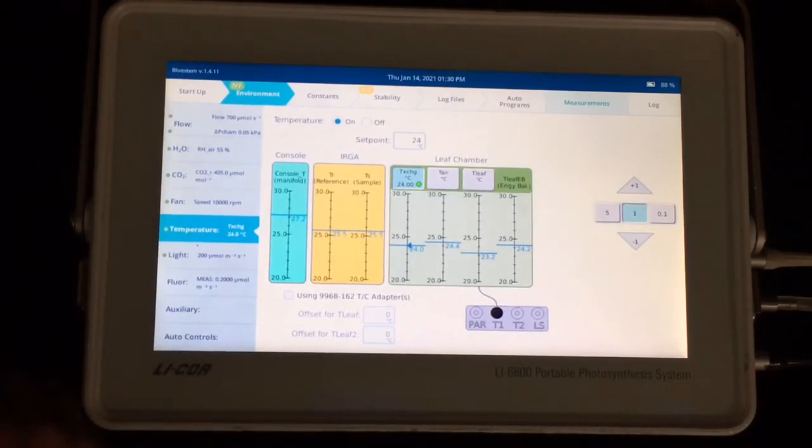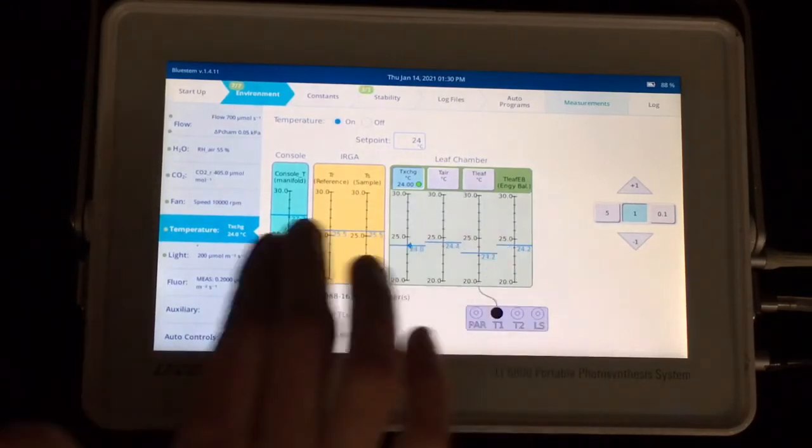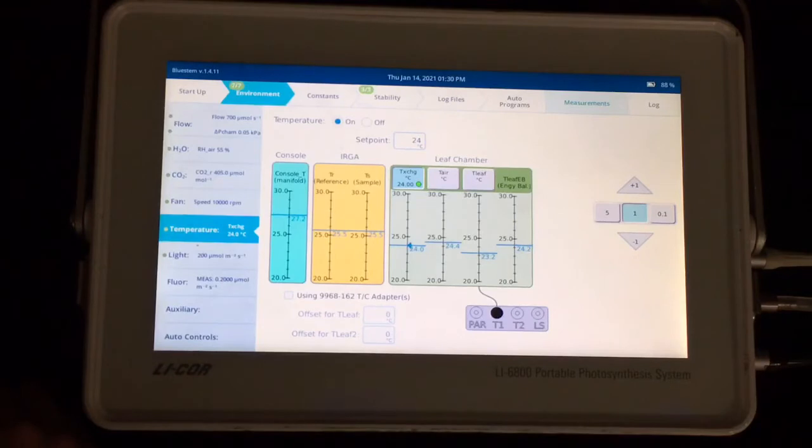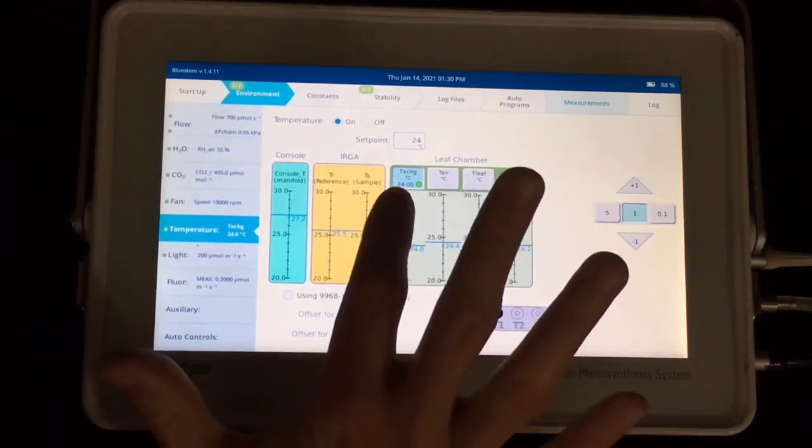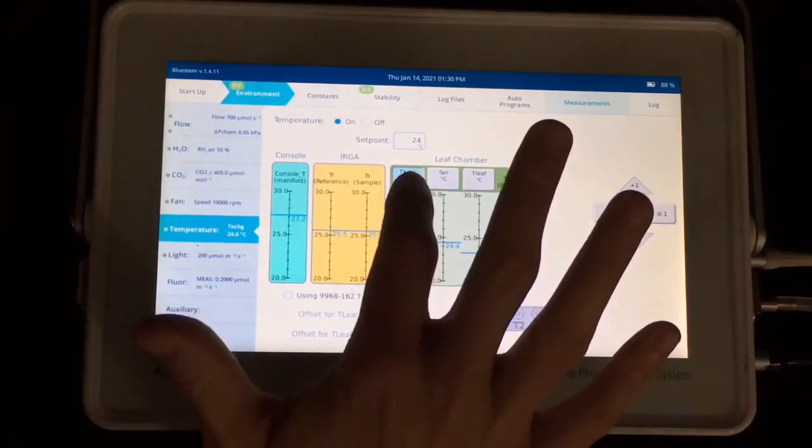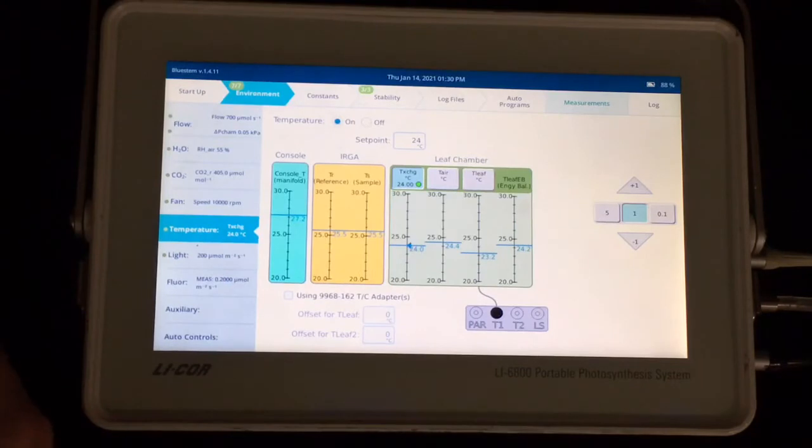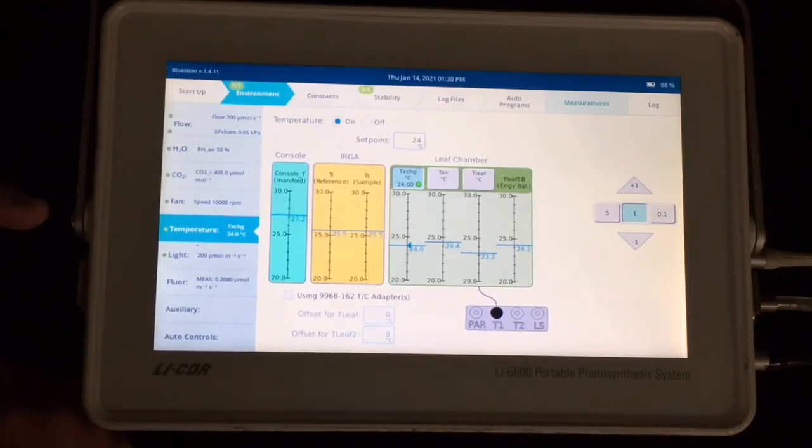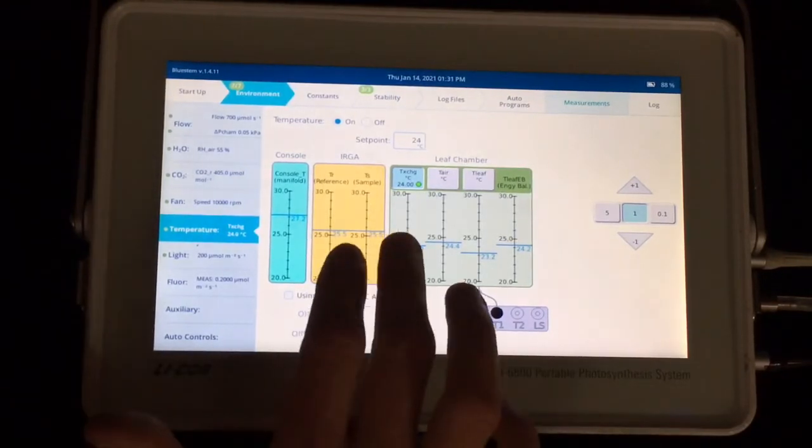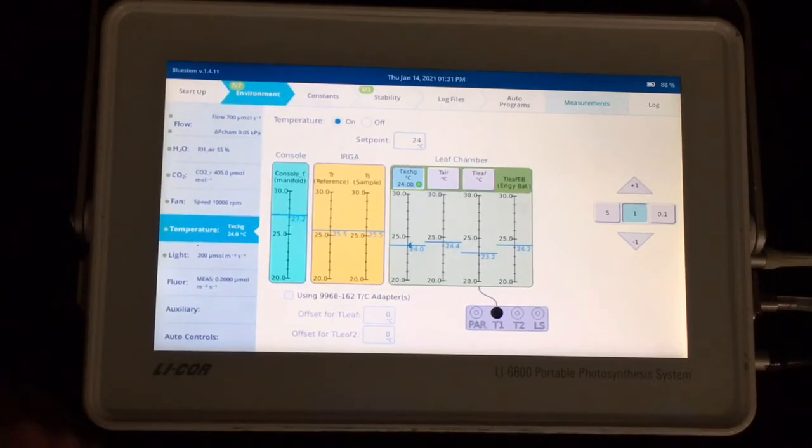Temperature control loops have an additional trade-off in terms of battery life. The harder you're going to make your temperature controller work, the more quickly you'll drain your batteries. These batteries do have quite a good lifetime, and so controlling on temperature is typically a good idea. Again, depending on the material you're working with and how sensitive to temperature they are. You do have a couple choices for which temperature to control. You can control the heat exchanger, which is further away from the leaf, but is not impacted by opening and closing the chamber. And that's typically a good idea because the temperature control loops tend to take a while. Adjusting the temperature in that chamber is relatively slow compared to the other control loops. And controlling that heat exchanger will give a relatively consistent leaf temperature while not slowing down your measurements. But to be really precise, you could control the air temperature in the chamber or the leaf temperature as well.